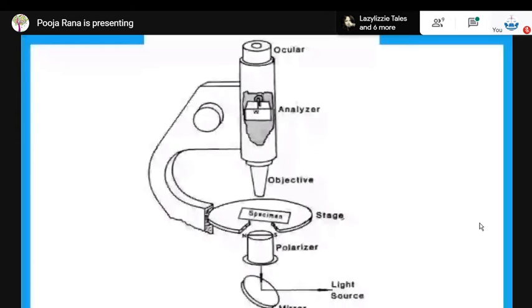Now over here, out of all these listed evidences, which evidences are you going to subject to the polarized light microscope? What objects would you be subjecting to analysis under a polarized light microscope? We talked about fibers, right? Hair, fiber, all right. Actually, we will not be subjecting hair, but fiber and soil, absolutely correct.